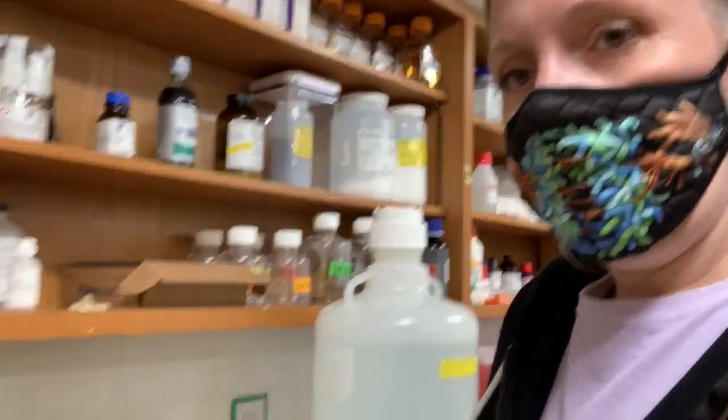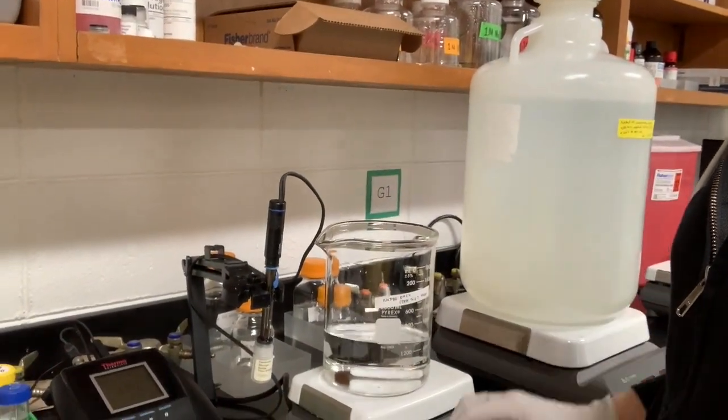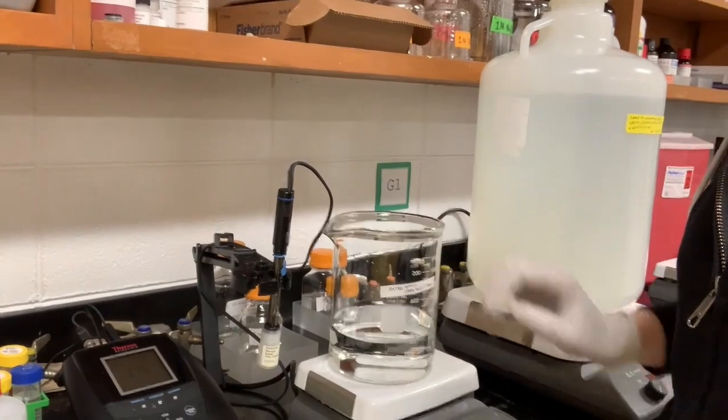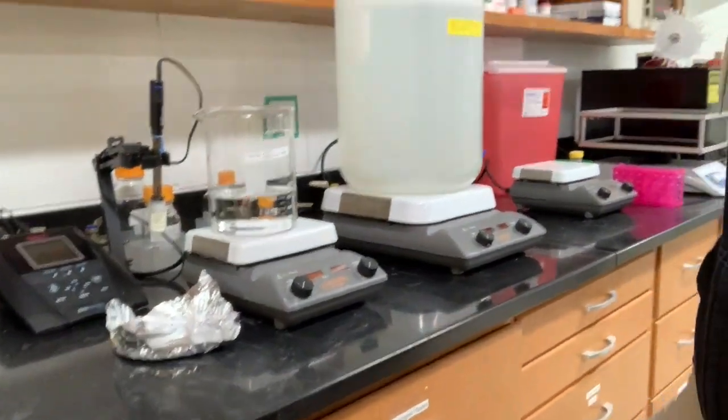And so now I'm going to walk back over to the chemical bench. I'm going to put this solution on a stir pad, and I'm going to go get a magnet. There are some magnets down below, I think.